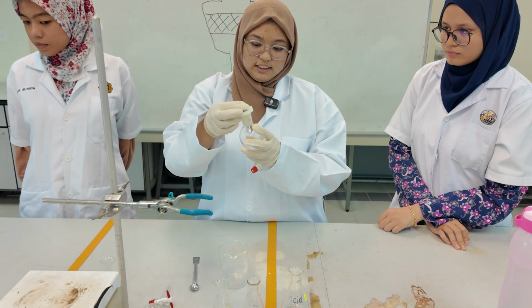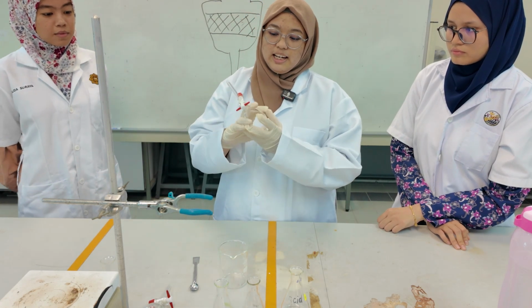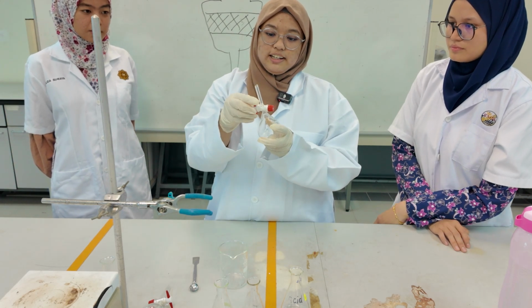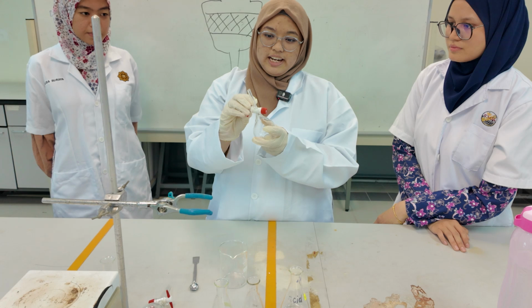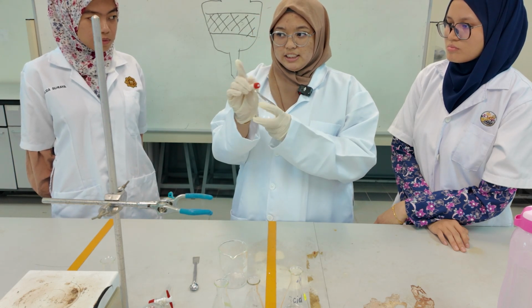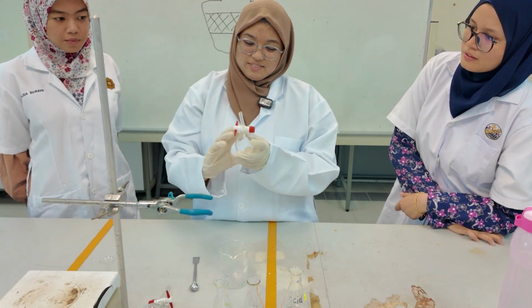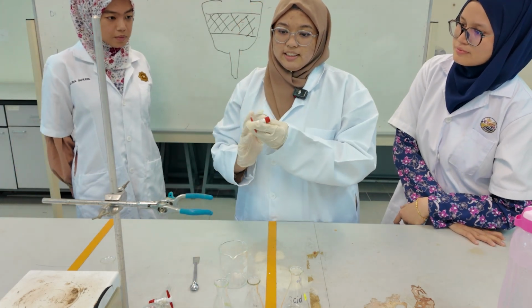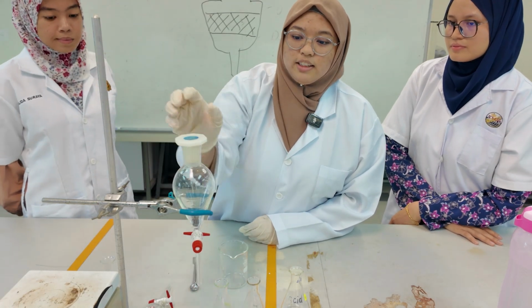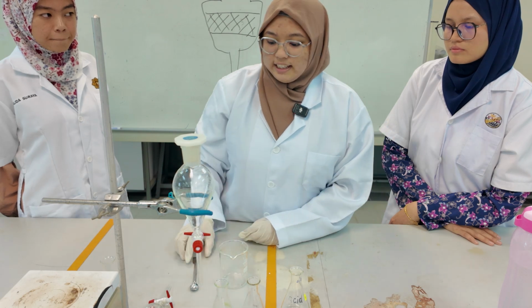Once that is poured in, we will have to shake this vigorously, and after shaking, make sure to release the pressure within it so that it won't explode. Make sure that when you release the pressure, the tip is facing away from your teammates. Now that everything has been mixed, this goes back on the retort stand, and we have to wait until there are visible layers.